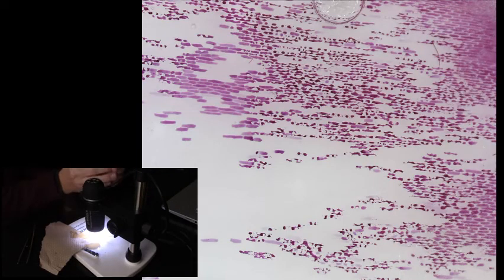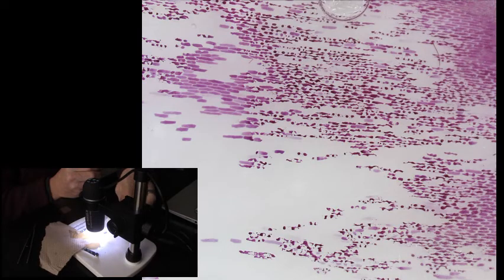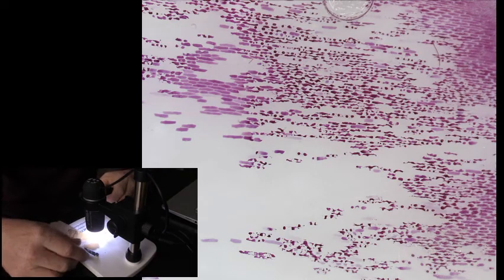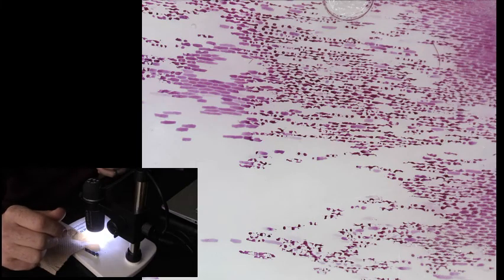You can see it's getting dark red because there's less water making up that cytoplasm. Cytoplasm used to be like a light pink because it was dilute because it's got a lot of water in it. And now it's becoming dark red and all shrunken. You can see the cell membrane shrinking right down. Really cool.